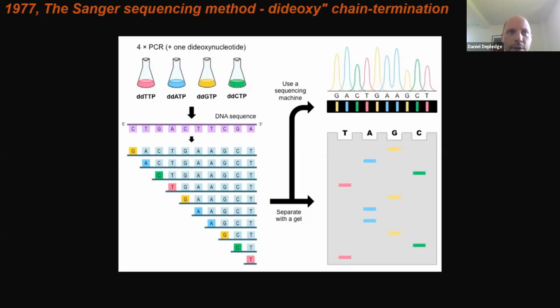So basically when you have your DNA fragment, you'll add in typical nucleotides such as dATP, dCTP, dGTP, and dTTP, a DNA polymerase, your DNA fragment of interest, and your primer will basically bind to a region of the DNA that you're interested in, and then these bases will begin to become incorporated by the DNA polymerase, creating copies.